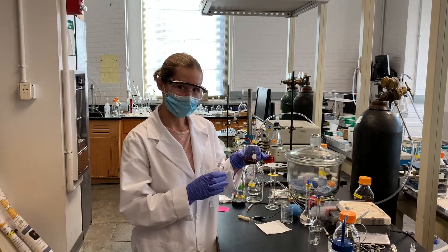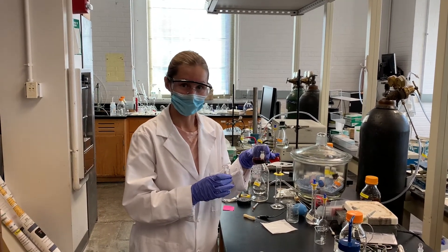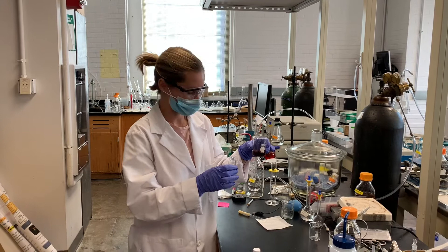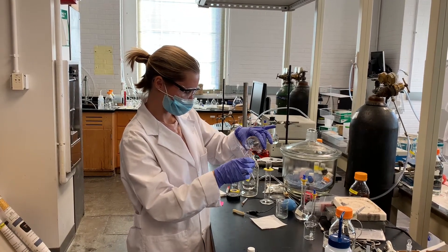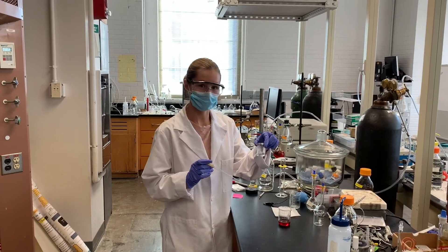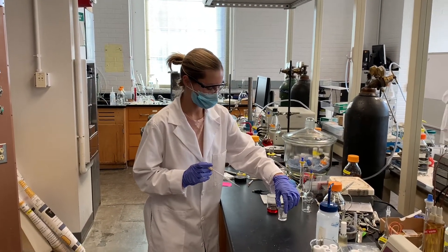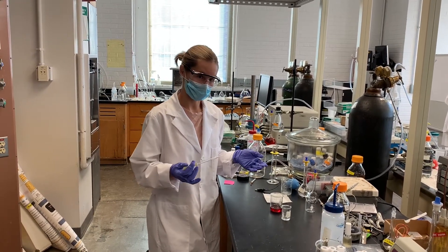We're going to save five milliliters of this nickel bippy complex for electrochemical and spectroscopic analysis. Using a solution of hexafluorophosphate, we're going to precipitate out the nickel bippy salt so that we can collect it by vacuum filtration.